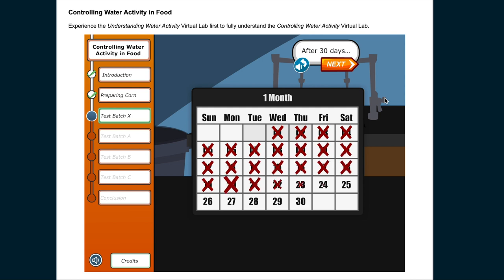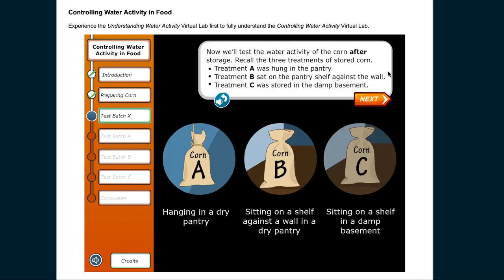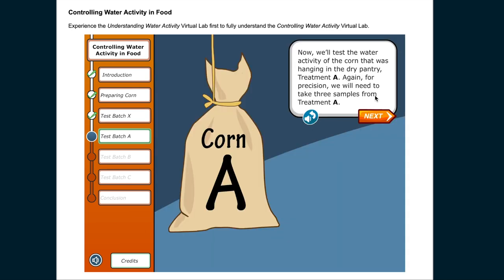After 30 days, now we'll test the water activity of the corn after storage. Recall the three treatments of stored corn. Treatment A was hung in the pantry. Treatment B sat on the pantry shelf against the wall. Treatment C was stored in the damp basement. Now we'll test the water activity of the corn that was hanging in the dry pantry, treatment A.